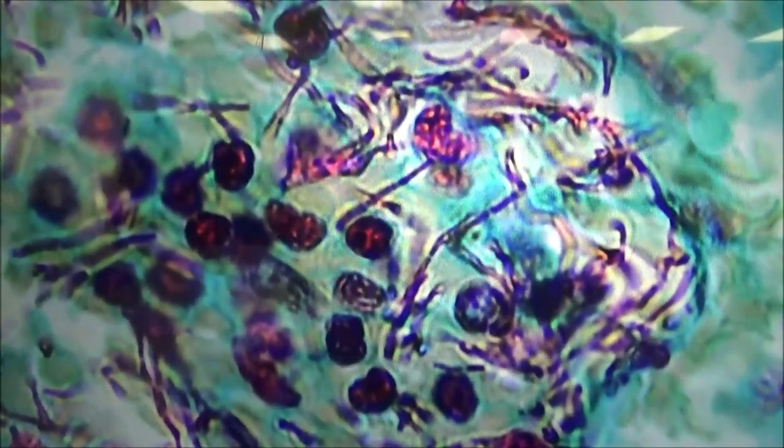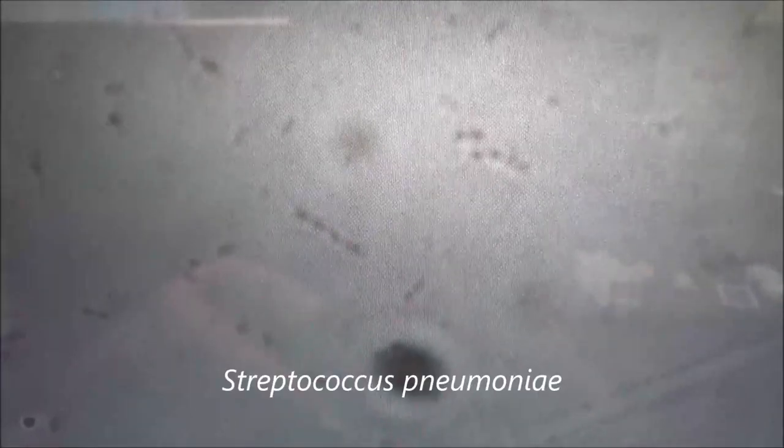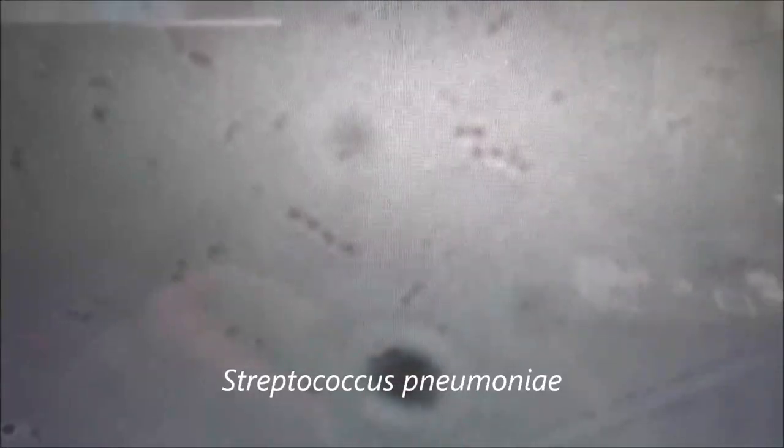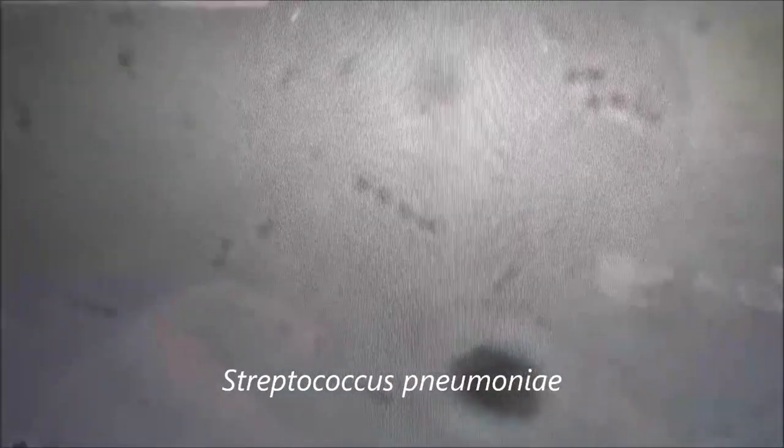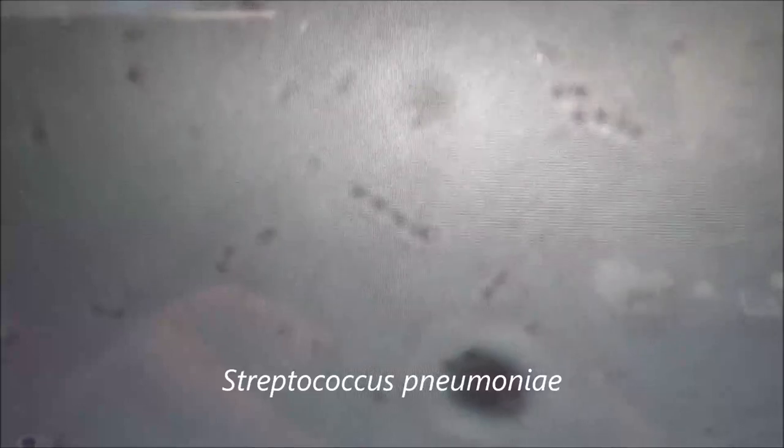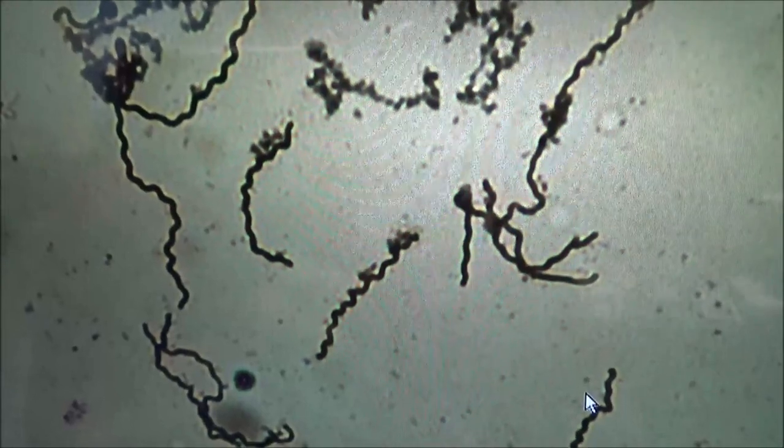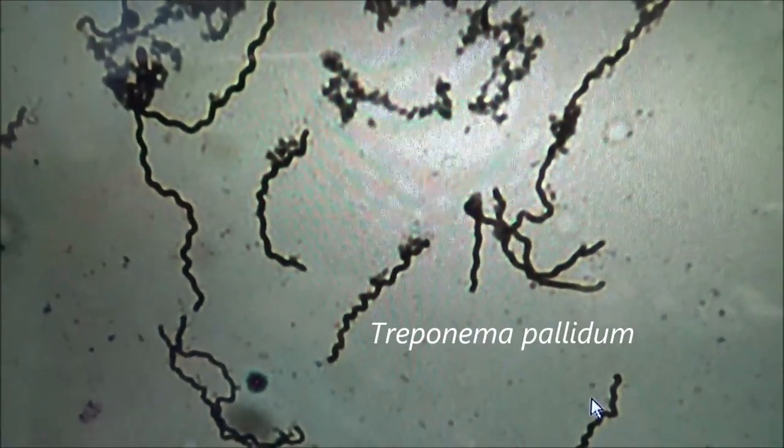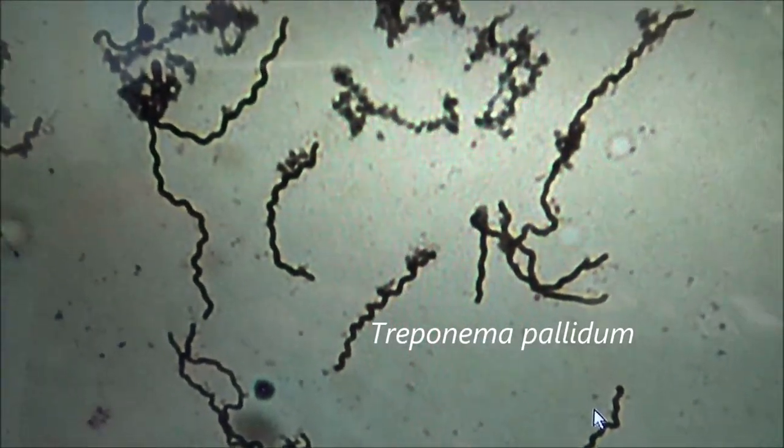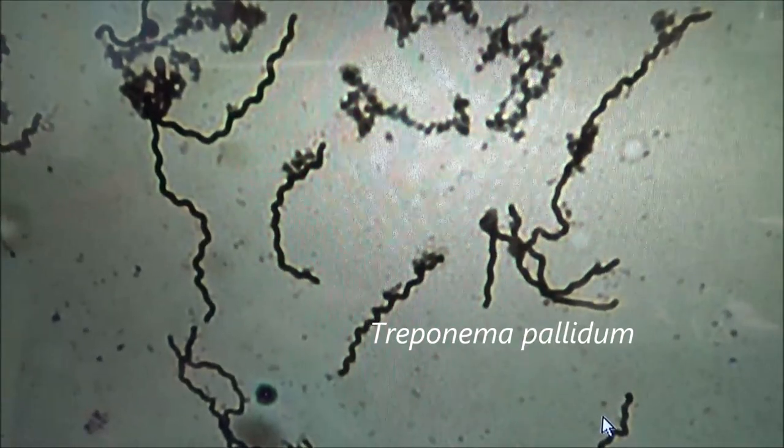Now let's look at the other two species. Here's Streptococcus pneumoniae. Notice the dots in a chain right there in the center, almost like beads on a necklace. You see there's a bunch of other debris on here—we just ignore that. But there are some in chains. So Streptococcus, beads of cocci in a row. Here is the last one, the spiral-shaped Treponema pallidum, the cause of syphilis, a sexually transmitted disease.